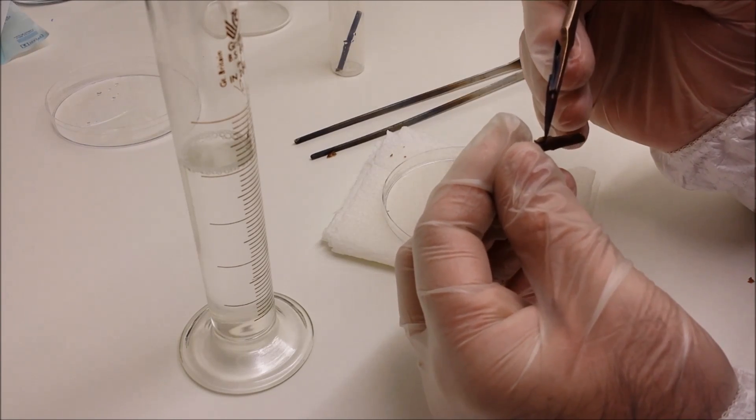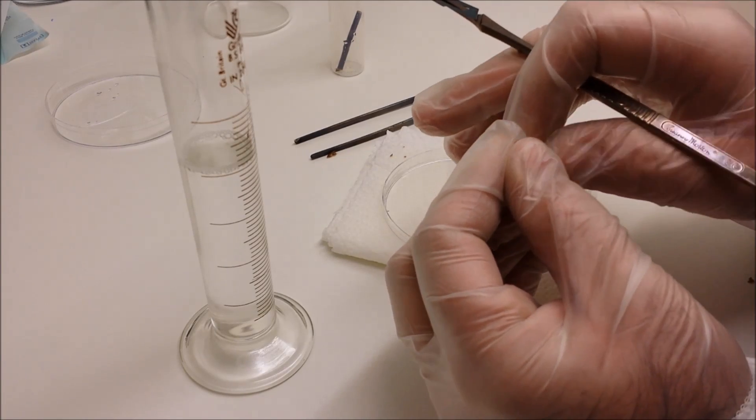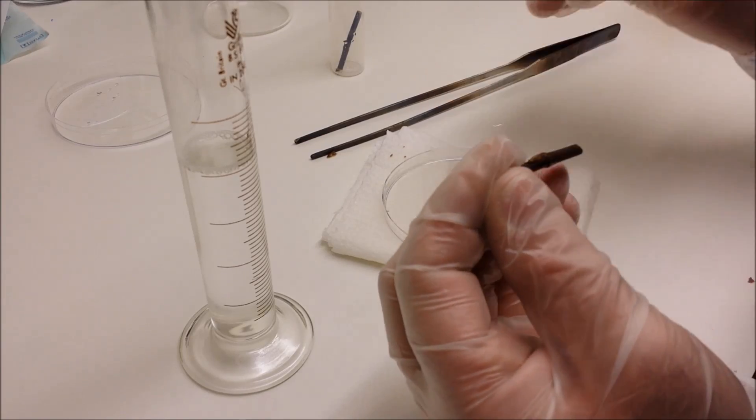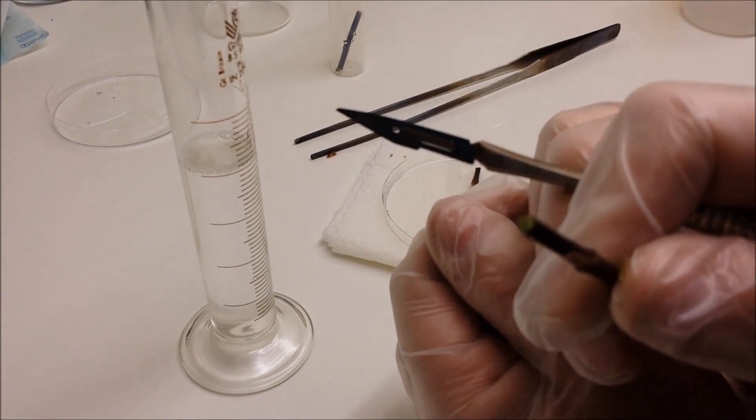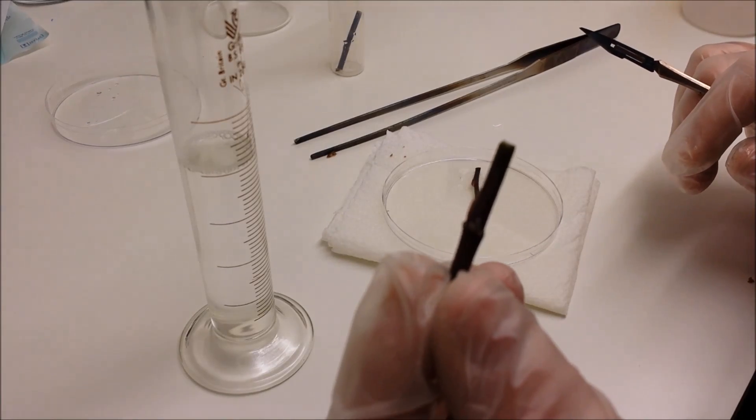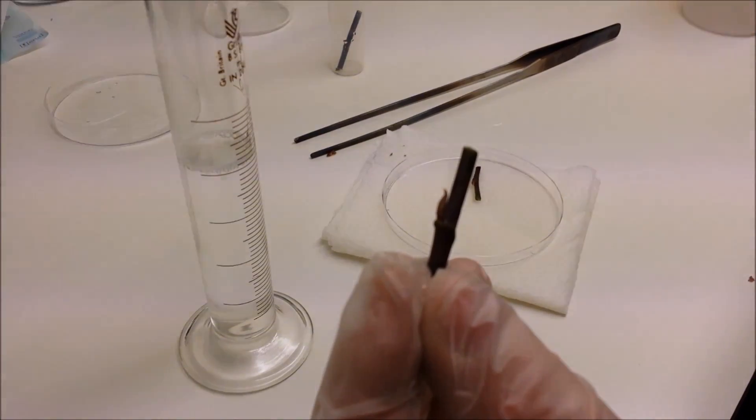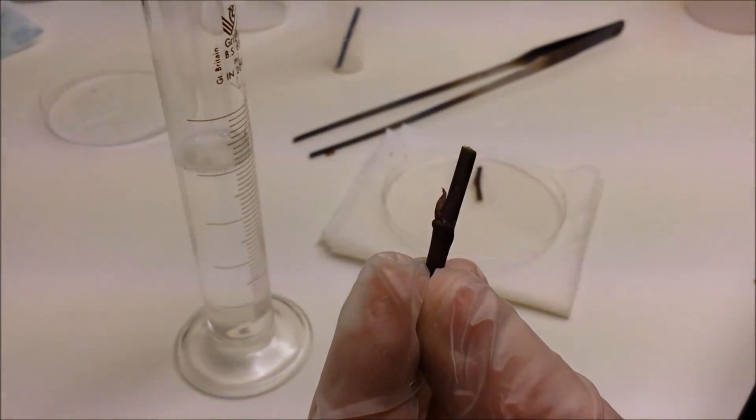And I'm using, you'll notice, the front sharp part of the scalpel as well as the back blunt side. So the sharp bit I'm using to make an incision into the sheath, and the reverse of it, the blunt side, I'm using to pull it down the stem. So hopefully now you can see that bud sticking out to the side, and that's what you're aiming for. That is what's going to become your little plant.